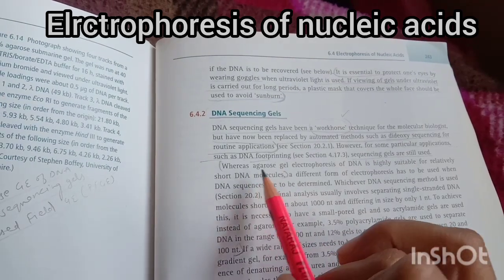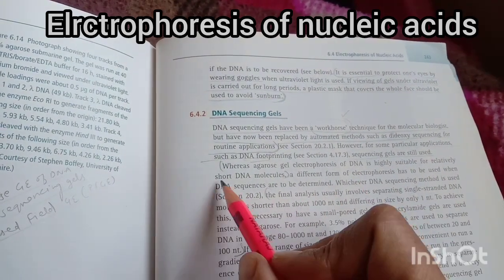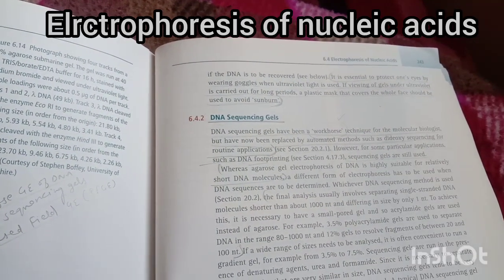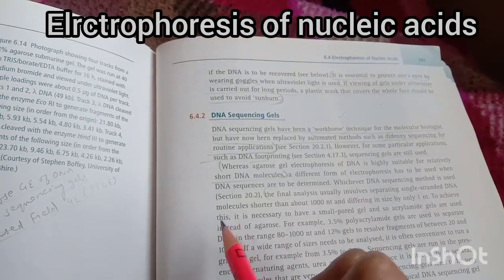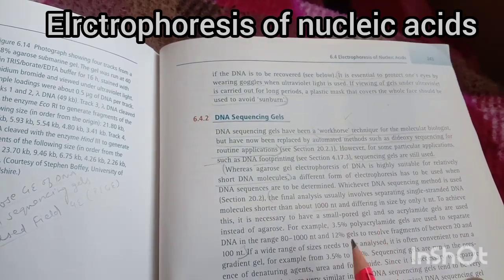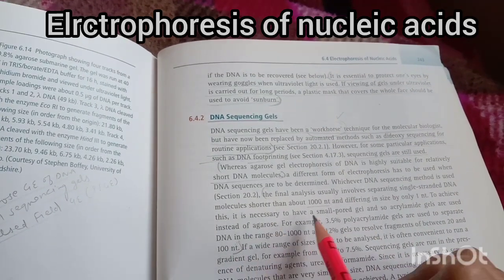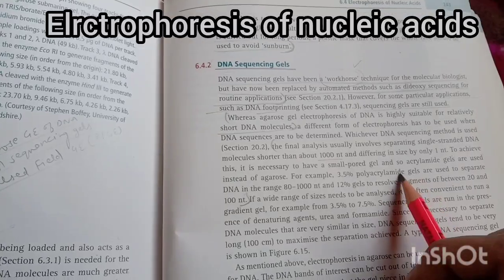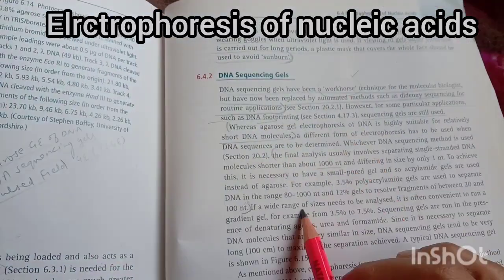So we all know that agarose gel electrophoresis of DNA is highly suitable for short DNA molecules as well as long and large size molecules. The final analysis involves separating single-stranded DNA molecules shorter than this size and differing in size by 1 nt. To achieve this, it is necessary to have a small pore gel in the DNA sequencing gel. So acrylamide gels are used instead of agarose.